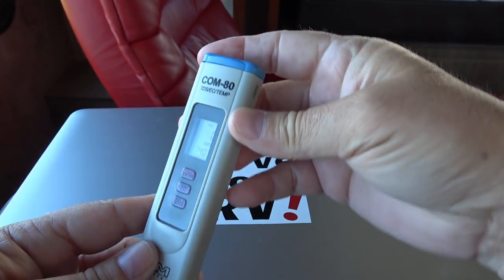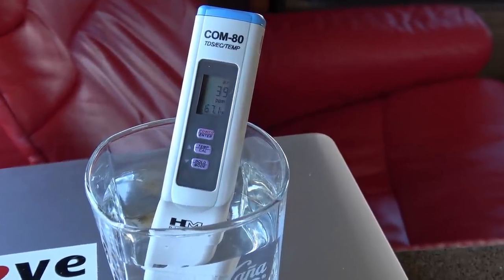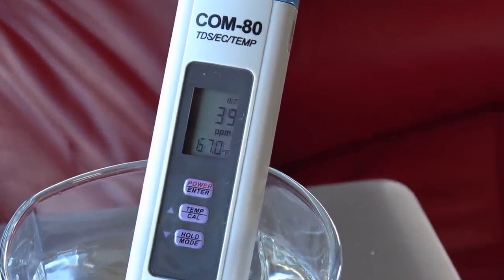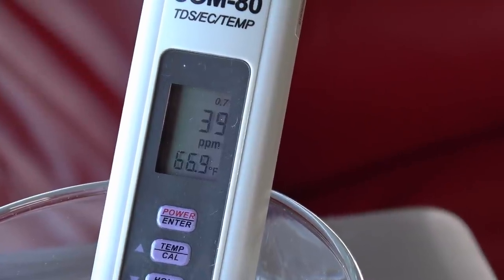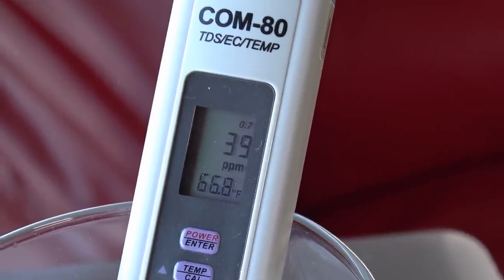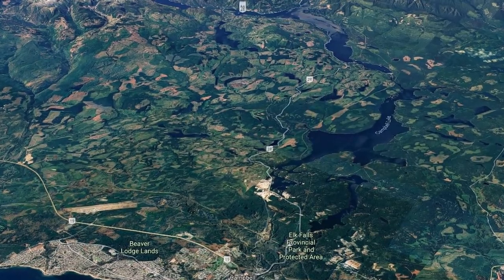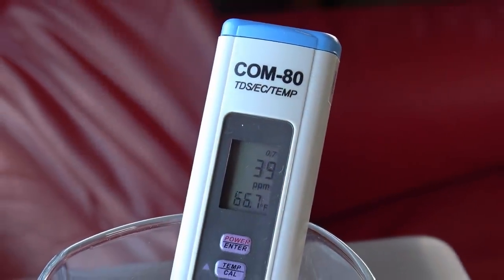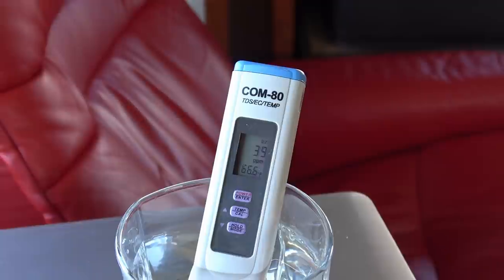Let's start out by checking just my tap water coming out of the tap in the RV right now. That's coming right out of the RV spigot into my water tank and then into the tap, and we have — looks like 39 parts per million. That's actually really good. Up here on Vancouver Island where we RV, the water is basically coming right out of a fresh water lake and then gets processed — it's city water that we're on. So maybe let's check some water out of the estuary. We're at a saltwater estuary, so I'll go get some of that water and we'll see what it reads.